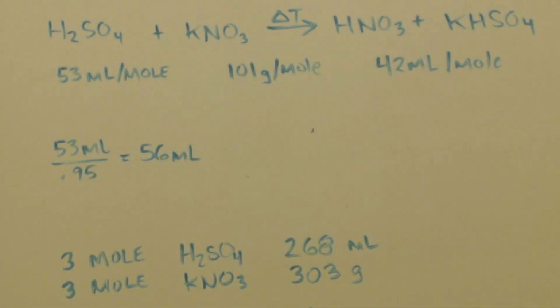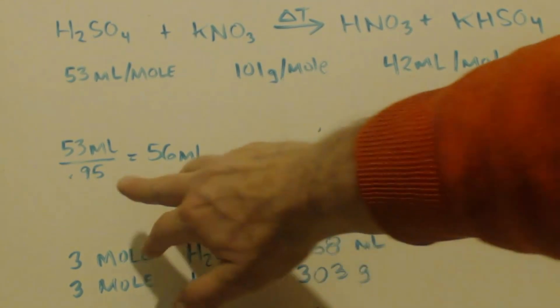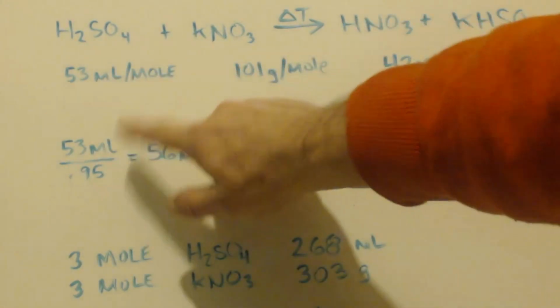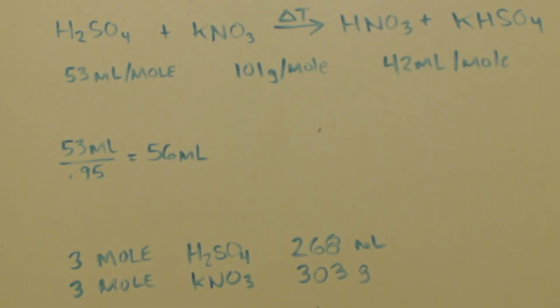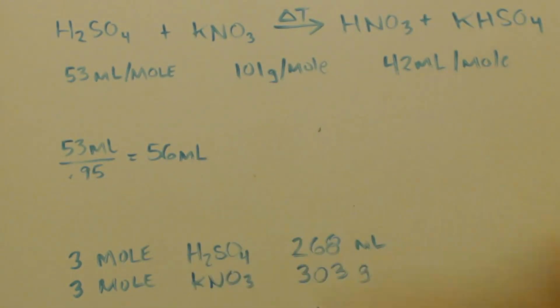There's the equation at top. Sulfuric acid plus potassium nitrate makes nitric acid and potassium bisulfate. Here's your molar masses and molar volumes. I'm just guessing, I put 95% sulfuric acid, so I divided so I can get how many milliliters I need out of the bottle to get this much sulfuric acid. It'd be 56 milliliters.